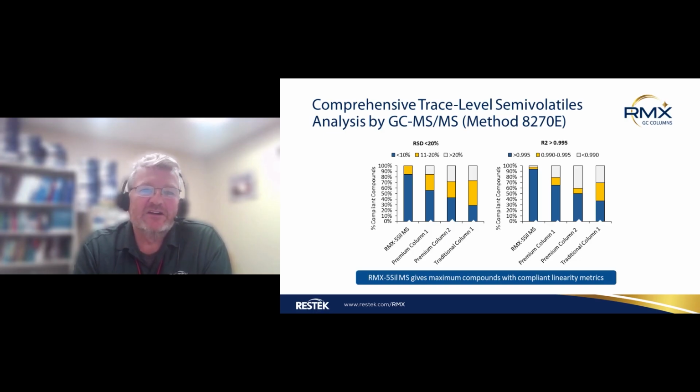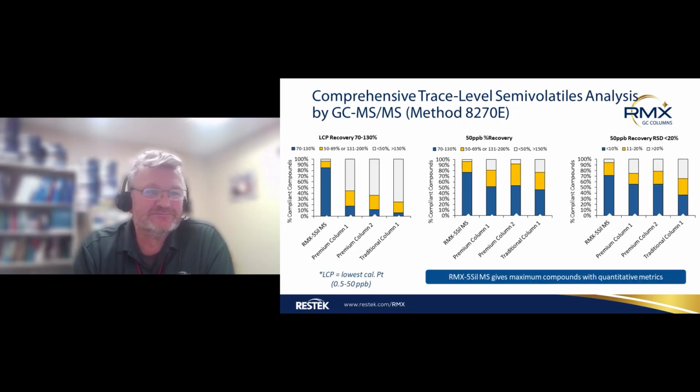So if we look at our percent RSD for a calibration curve, in this graph, you can tell that we are below 10%. So the below 10% is better than 80% of the compounds. And so this is a really good graphical representation of how solid this column is for very low levels. The correlation coefficient is even more indicative of the performance of this column with the calibration curve, because we're better than 90% for 0.995 correlation coefficient.